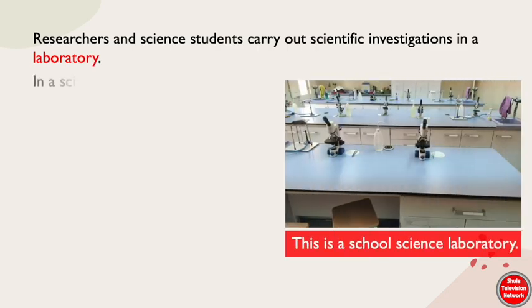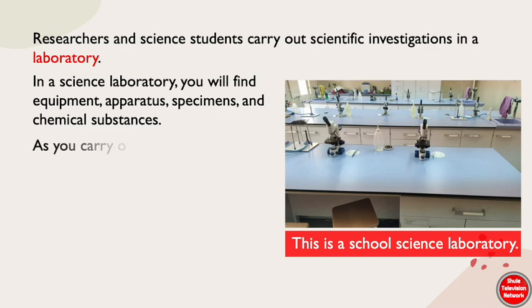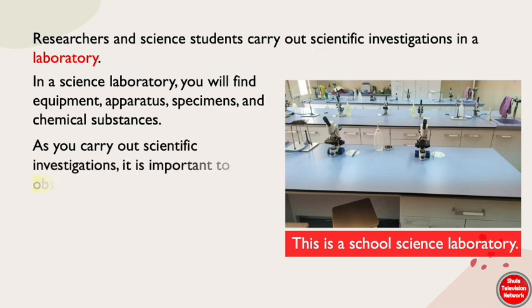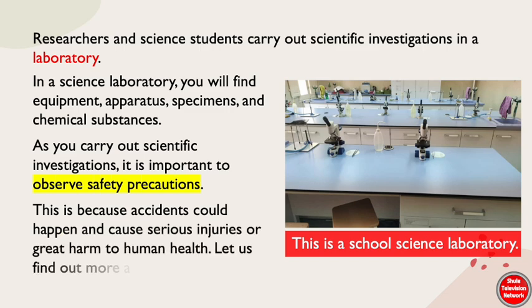This is a school science laboratory. In a science laboratory, you find equipment, apparatus, specimens, and chemical substances. As you carry out scientific investigations, it is important to observe safety precautions. This is because accidents could happen and cause serious injuries or great harm to human health.